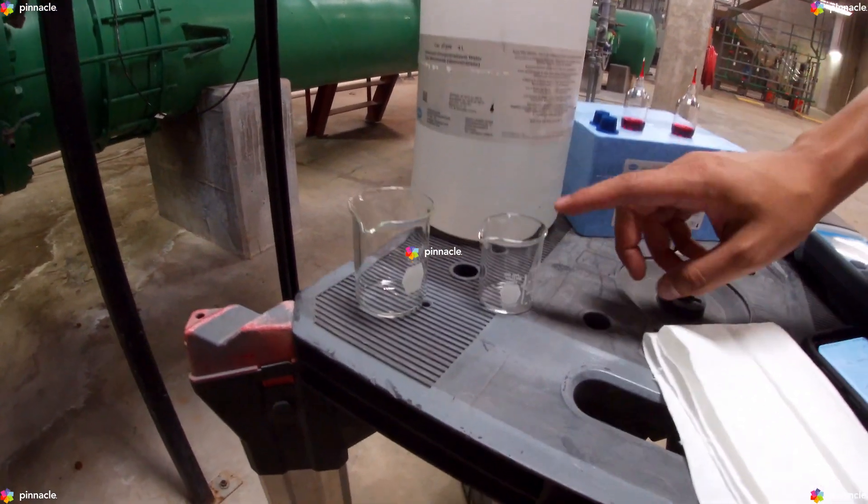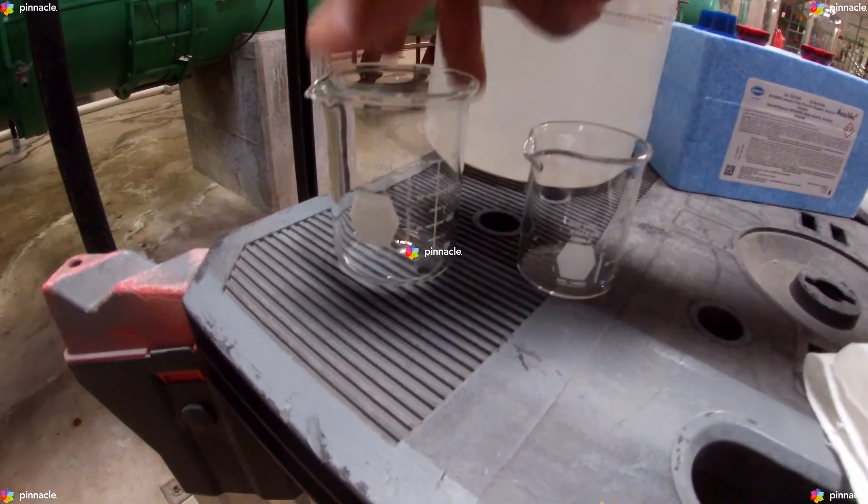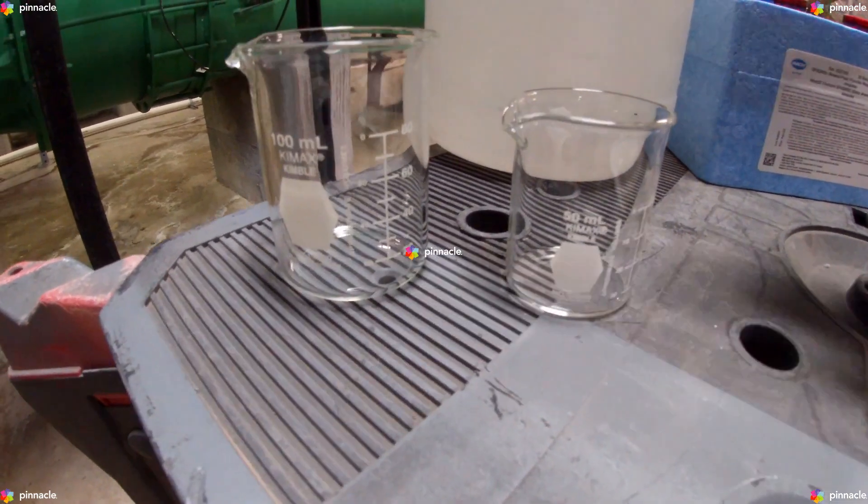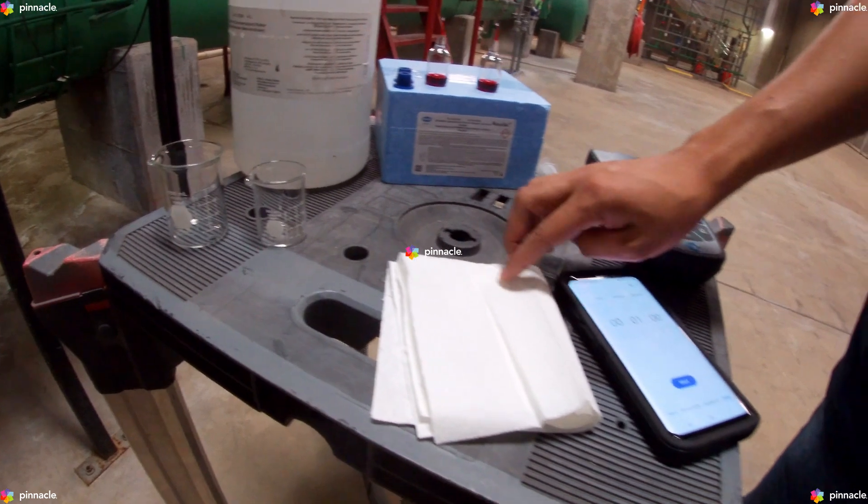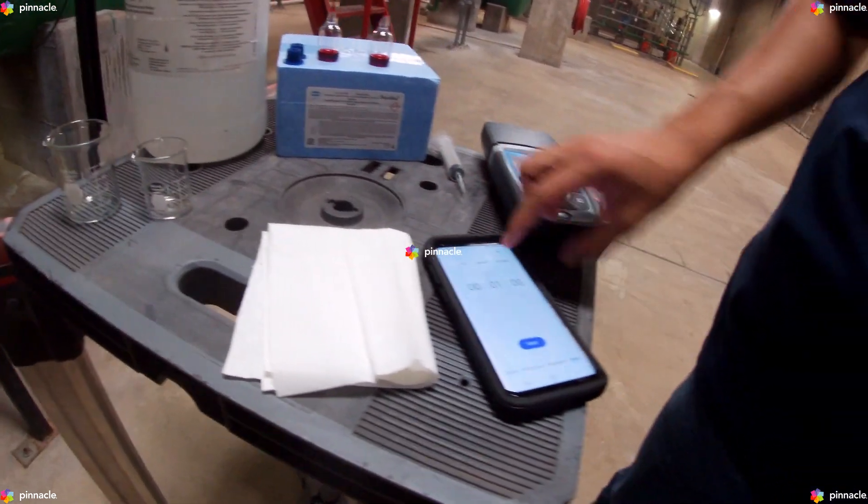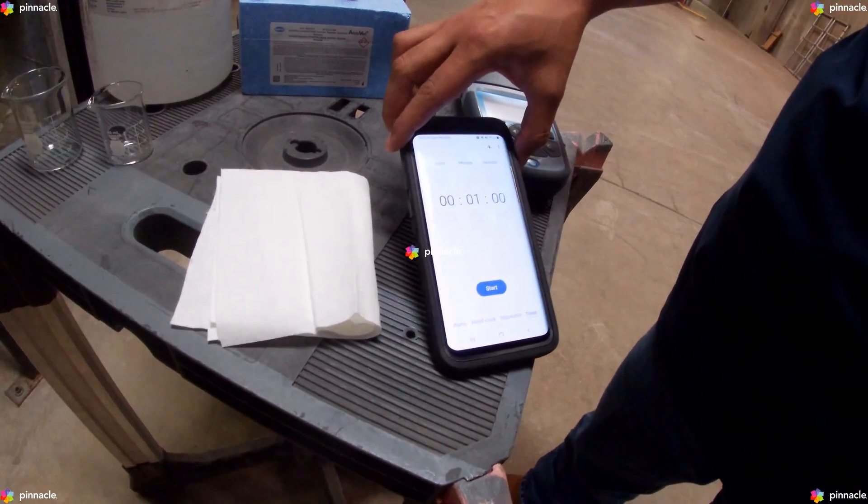We'll also need two beakers capable of measuring at least 40 milliliters each, a paper towel, and a stopwatch set for one minute.